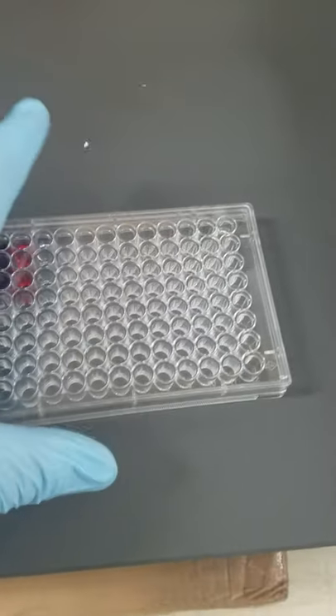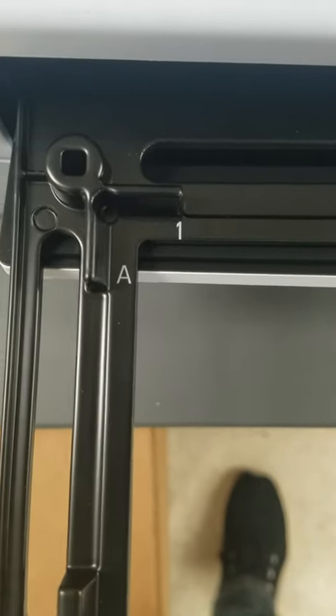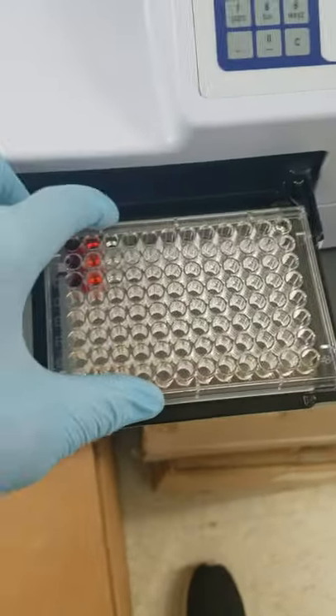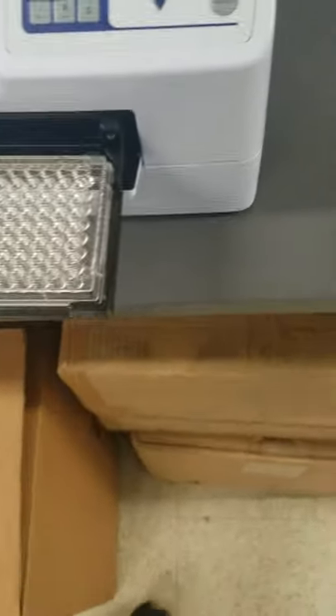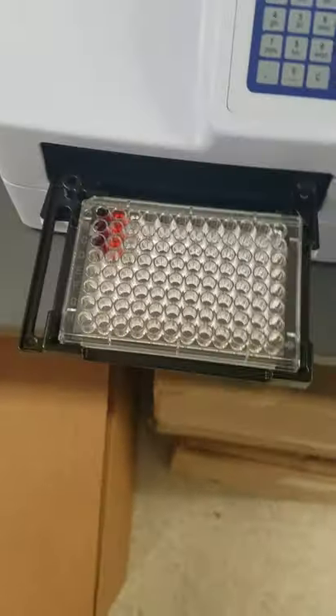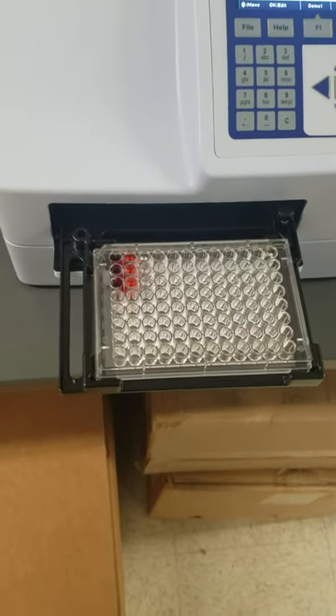First thing we want to do with the plate is take off the cover, otherwise we will completely crash the machine. We want to place it — see where it says A1 — we want to place our A1 well where it says A1, and it fits in there real snug. Make sure that it's not set like this or this, because you will crash the machine if it's not loaded correctly.